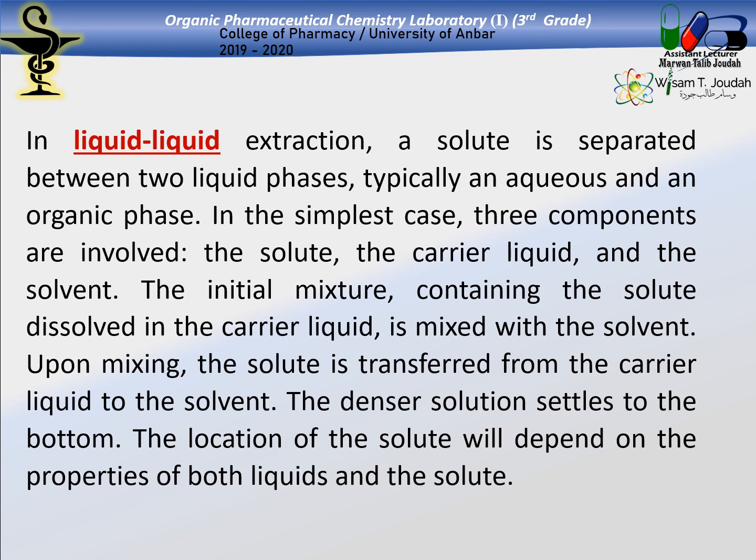If both of them are similar in polarity, either both polar or both non-polar, what will happen? We will have one mixture, so I cannot extract them. So they must differ in polarity. In the simplest case, three components are involved in a liquid extraction: the solute, the carrier liquid, and the third one is the solvent.